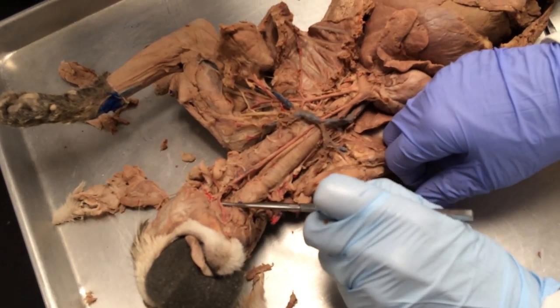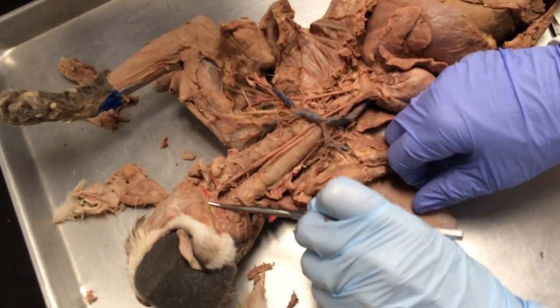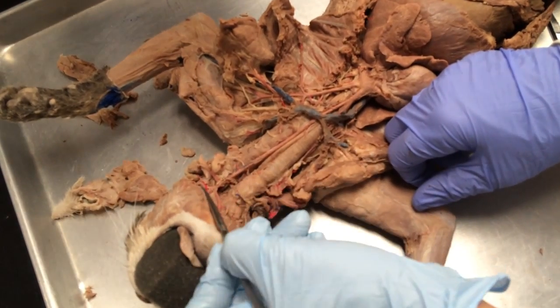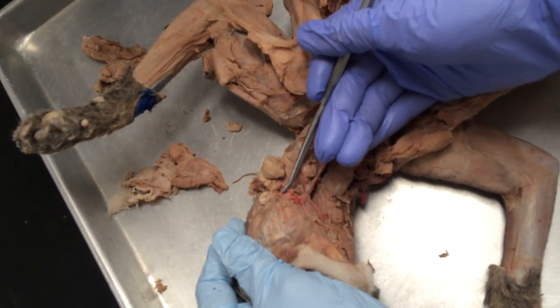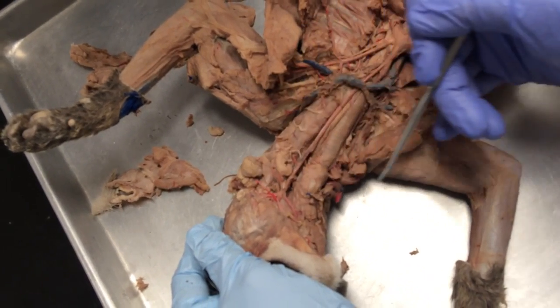Okay? And now we have our lingual, which goes straight up to the tongue. We have our maxillary. We have our temporal. And then our last branch is the auricular. Okay, so the temporal's coming up that way and then the auricular.